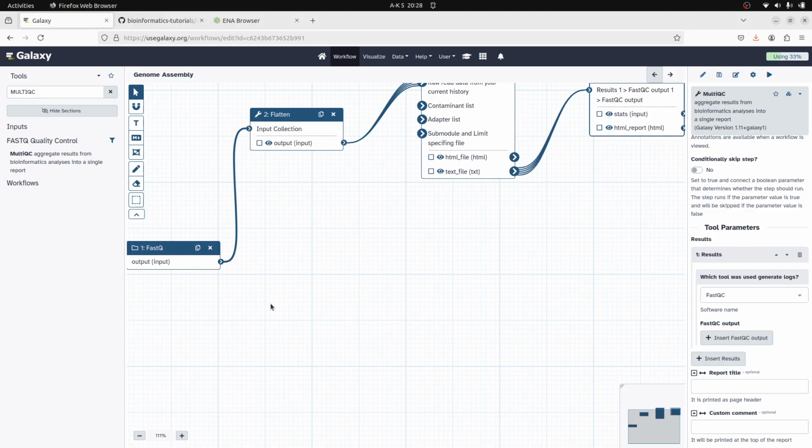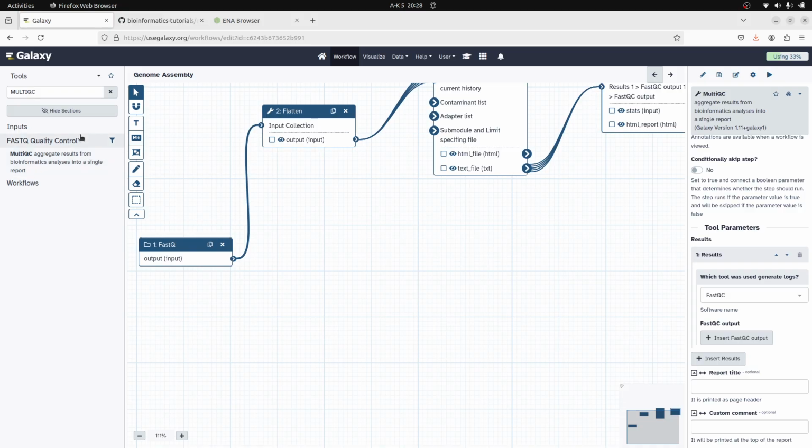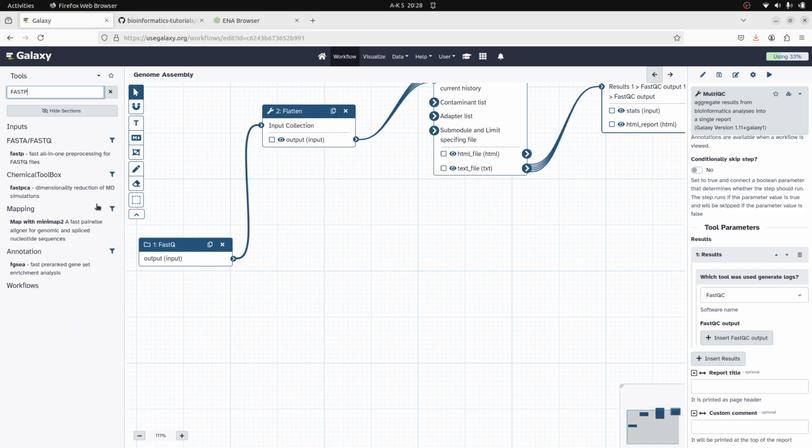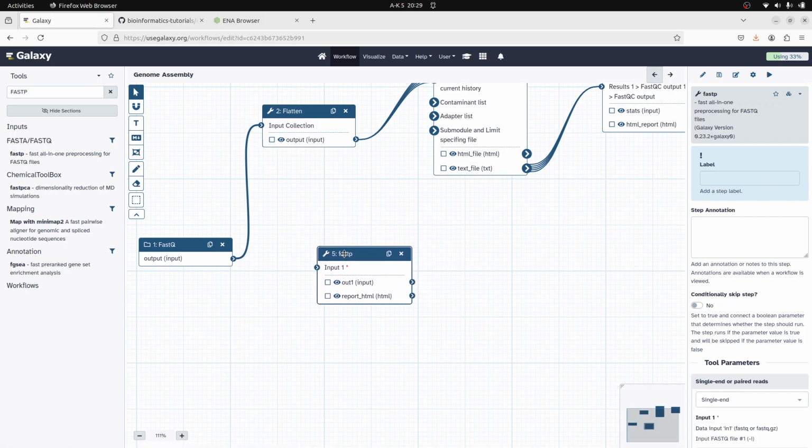All right. So here I'm going to trim all the samples. So I'm going to use FastP for trimming. I'll just type FastP, and it's going to come. So I'll click it and it's also going to come here. Note that there are several trimming tools available. So sometimes it can boil down to preference, or sometimes it can also boil down to the sequencing platform or some other criteria. So always read about them and see which one is appropriate for you.